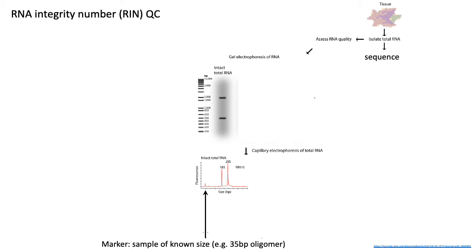So oftentimes in practice, it's pretty hard to get consistently good RNA across all of the samples in your study. For example, for people who try to study gene expression patterns across multiple human tissues, oftentimes your tissues are coming from a variety of individuals. Some individuals are still living when they donate their tissues, whereas for some types of tissues like brain samples, you can only typically get those from deceased individuals. RNA quality in general degrades quickly once an individual has passed away. And so the quality of your RNA can vary widely across your samples.